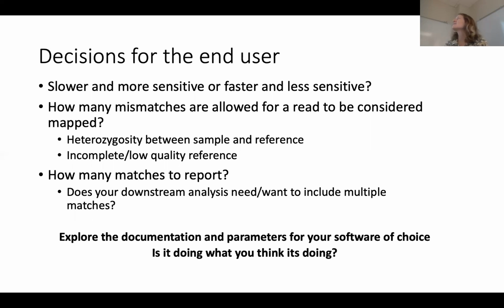And sometimes this just depends on, are you trying to map, is the individual sequence quite genetically distant from the reference genome, or is it quite similar? Is your poster due tomorrow and you need it to run very fast? Or do you have plenty of time to let the sensitivity be really high and wait?